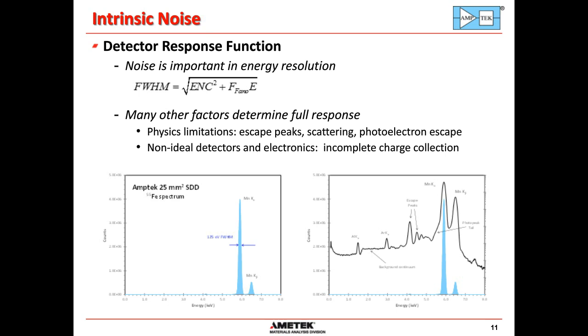It's important to note there are many other factors that determine the full response function of the detector to radiation. There's escape peaks, there's scattering, Compton scattering, Auger scattering, photoelectron escape. So there's a whole pile of issues. We're focused here today simply on the intrinsic noise.